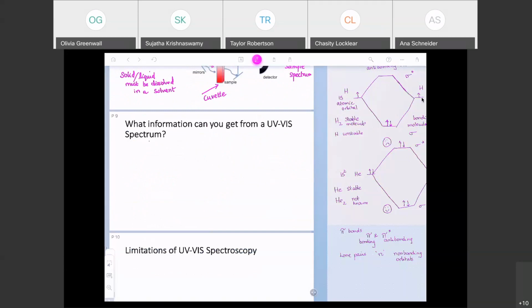Information that you'll get from the UV vis is lambda max. So you're working in research and you get a lambda max, you can work backwards. Working backwards, you can even say that this lambda max means you have so much conjugation, which means you have so many double bonds in resonance. It gives a lot of idea about the structures of the molecules, but you don't get any other information from the UV vis. This is all that you get. So it's not as powerful as the infrared and NMR that give you the complete structure of the molecule, but it does tell you a lot about conjugation.